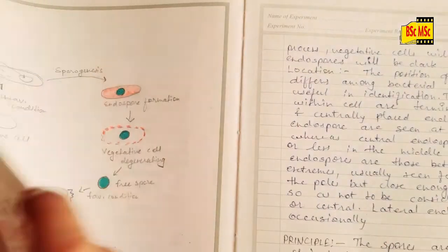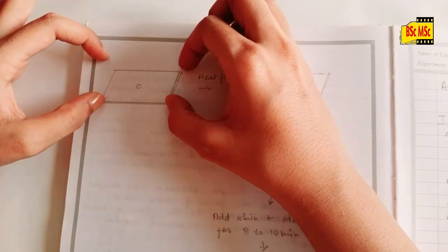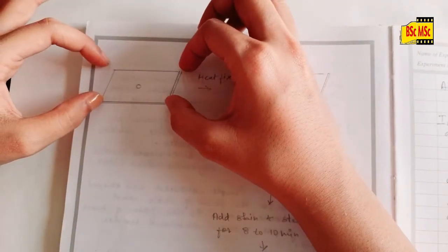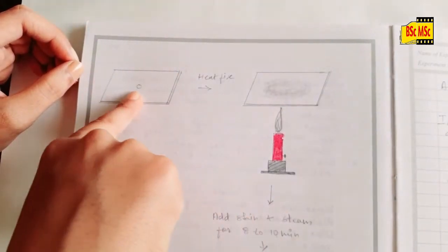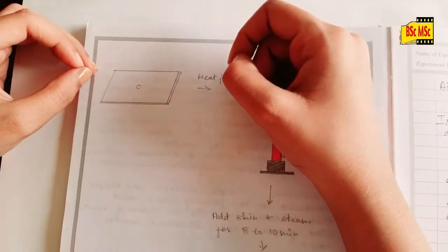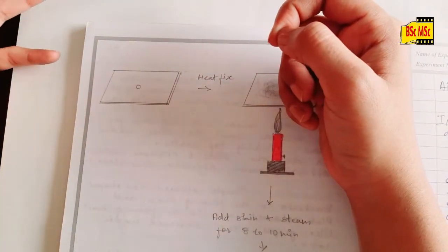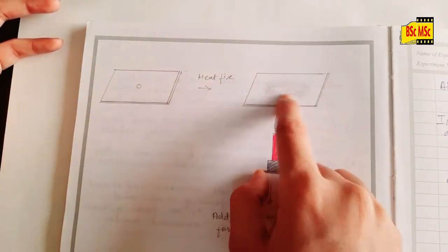And now we will start the procedure. I'll be showing you with the diagram. You need to take a clean glass slide, and you have to take a 48 hours or 36 hours old culture. Then place a drop of distilled water. Take an inoculating loop, take the pre-grown culture, make the smear and heat fix the smear.